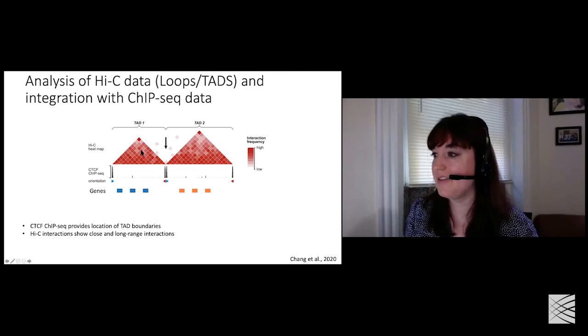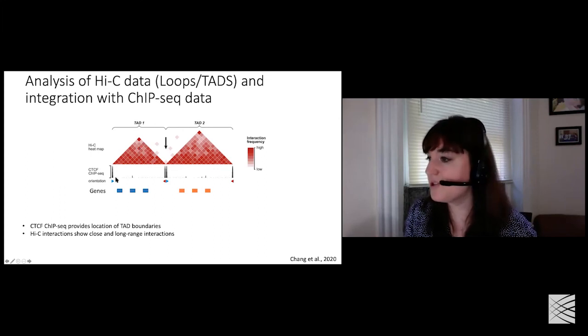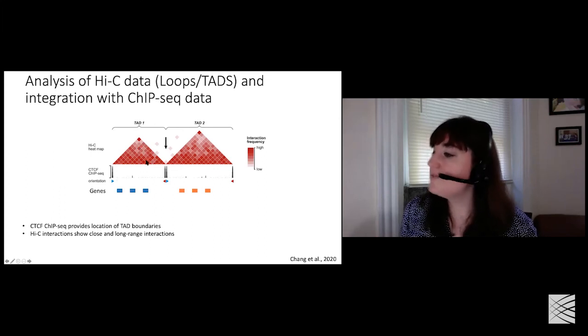They will be assigned a color based on the bin, right? So if you have more, smaller bins, there are going to be more squares here with different colors. But if you have larger bins, your square sizes are going to be larger, right?